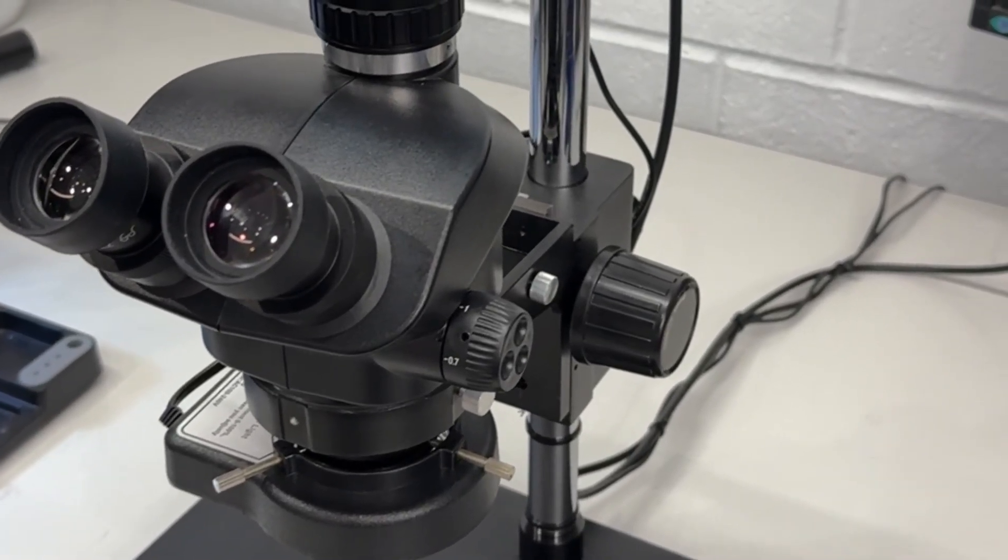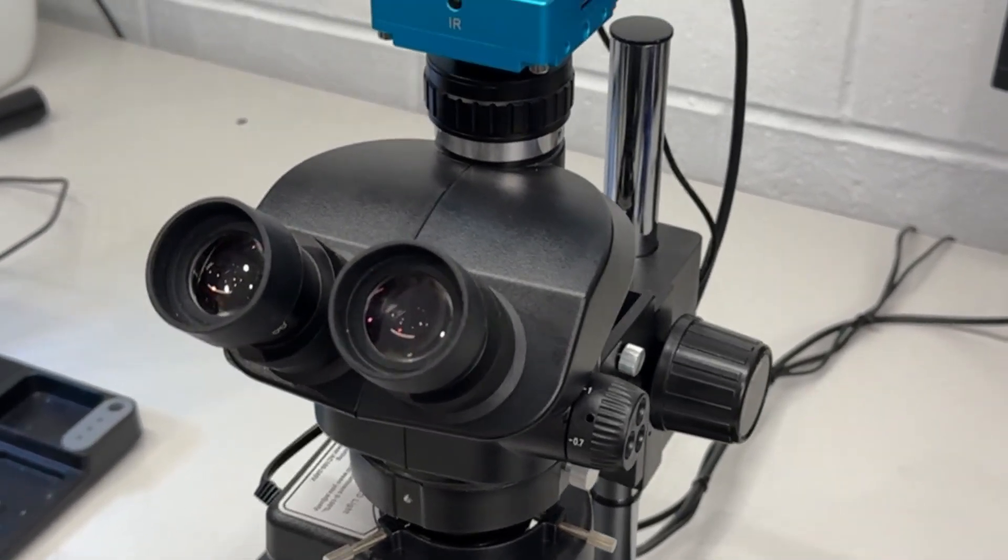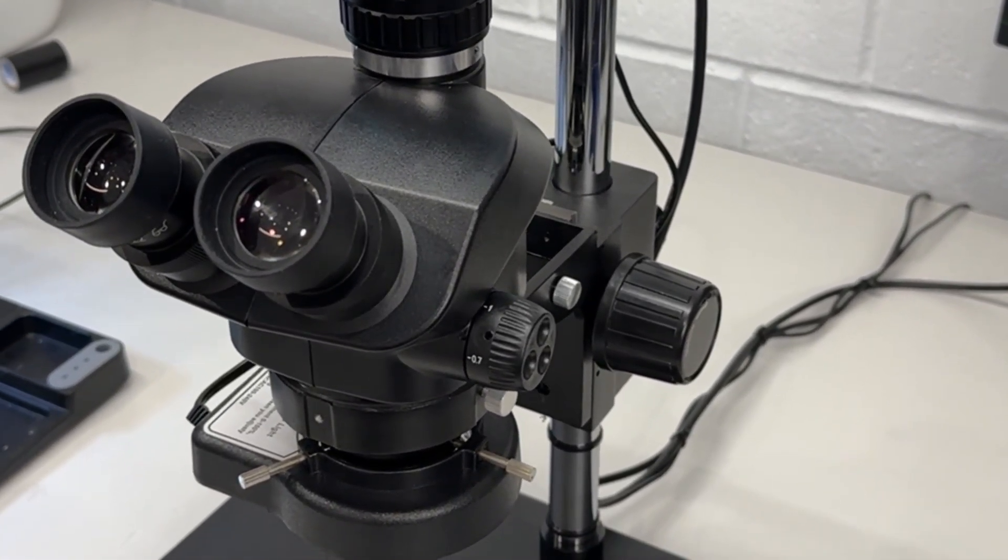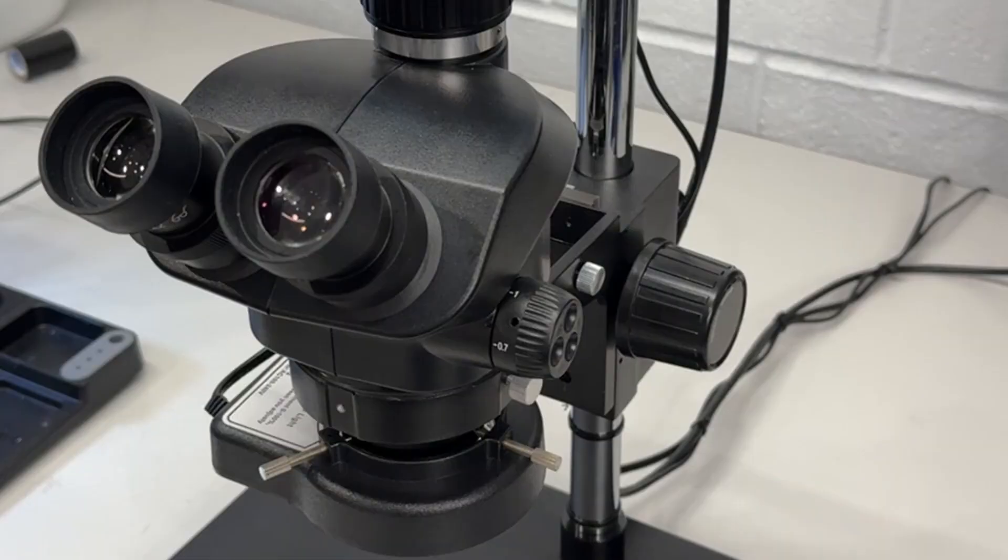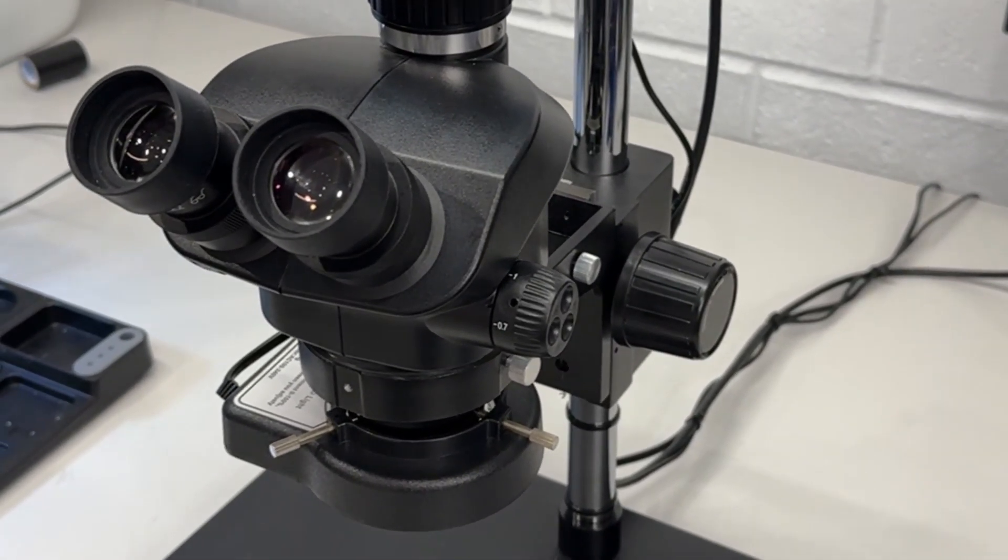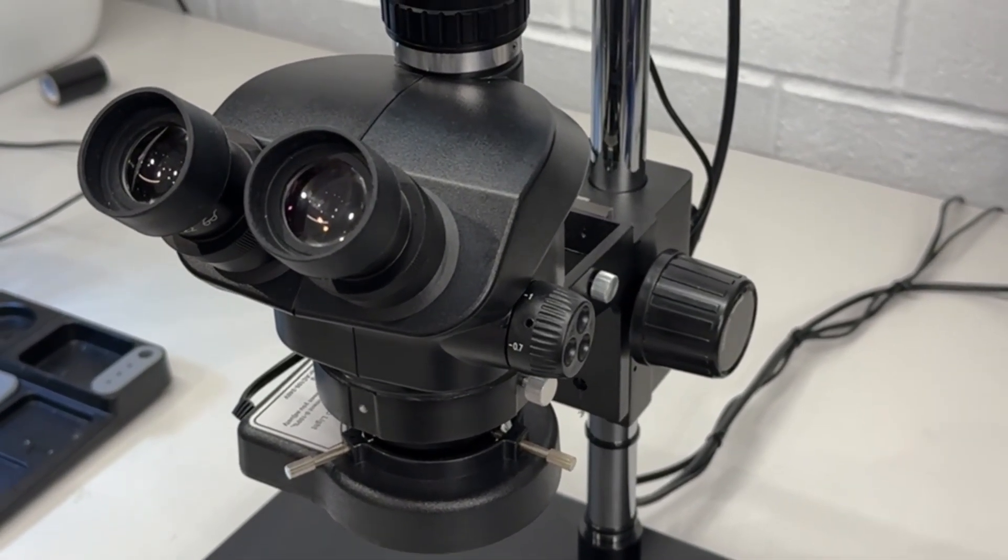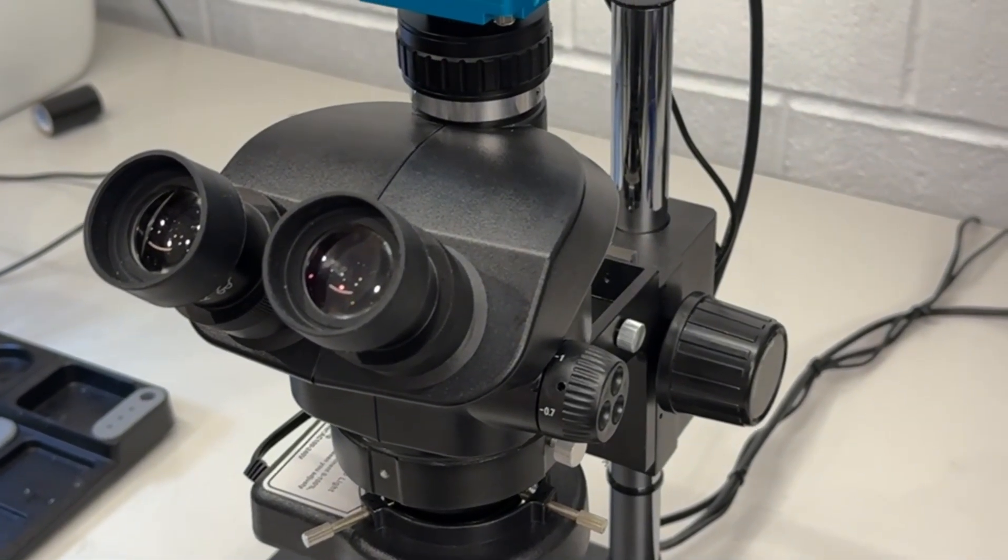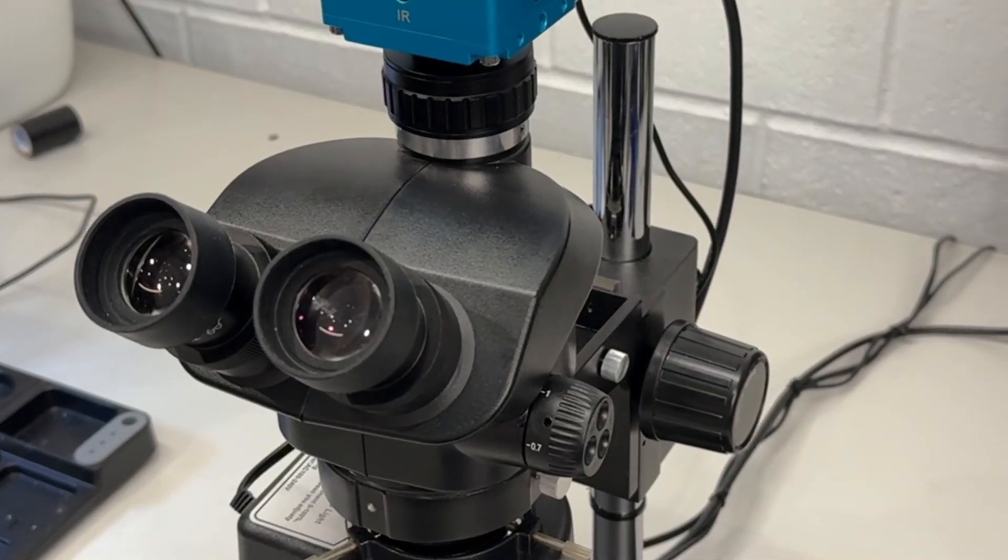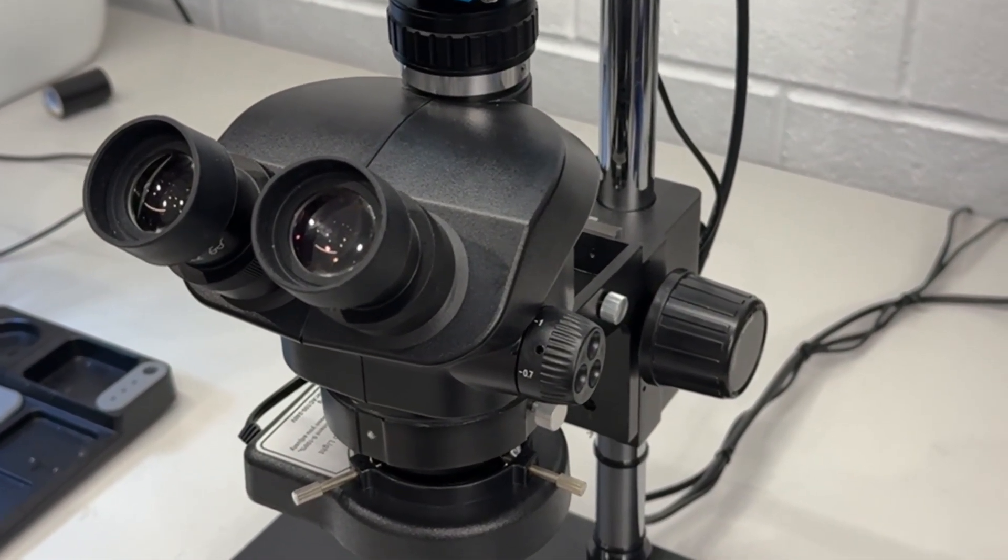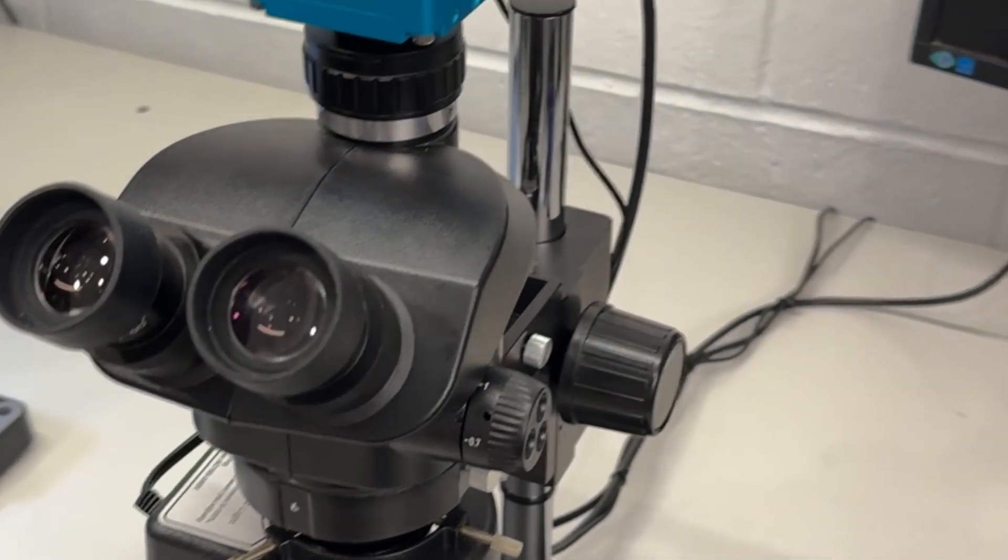Hey guys, welcome back to my YouTube channel ArtXLab. Today I've got this giant machine on my desk and it's gonna be a different video because here I'm going to give you a quick rundown of this beautiful microscope.